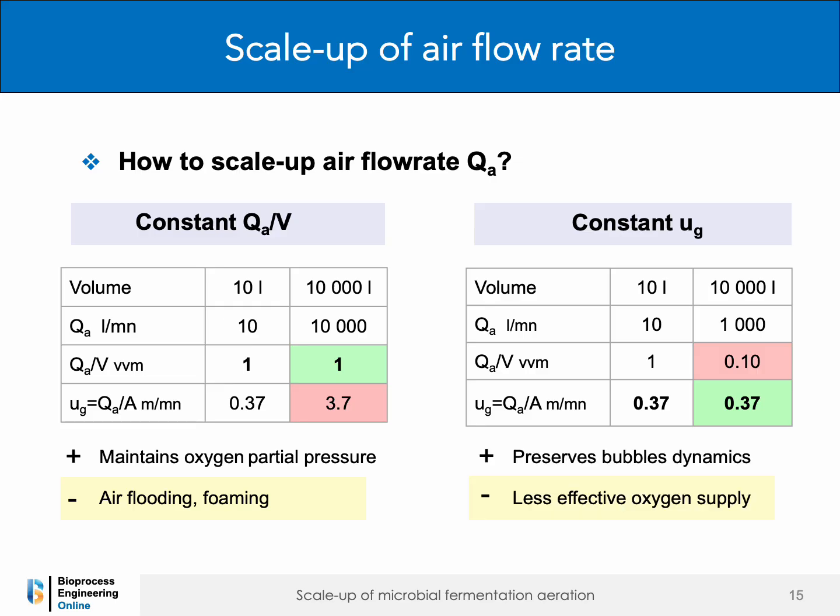This approach preserves bubble rise velocity, gas holdup, and general gas-liquid hydrodynamics. It also reduces the risk of air flooding and excessive foaming. However, it is less effective at supplying oxygen throughout the entire fermenter volume.